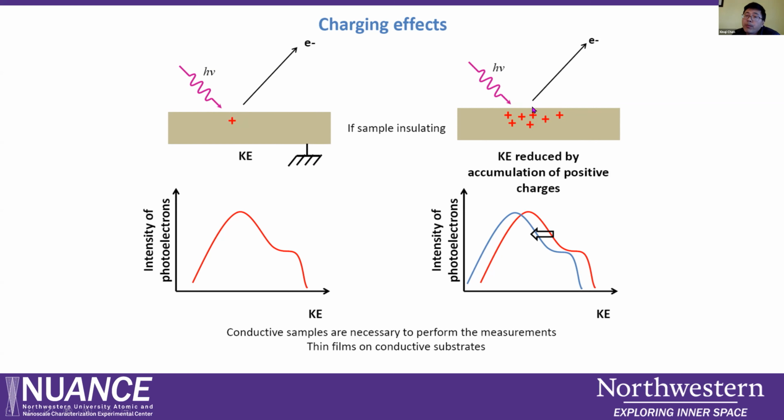So this builds up charging. When further electrons come out, they lose energy, and the analyzer sees less energy because of this loss.